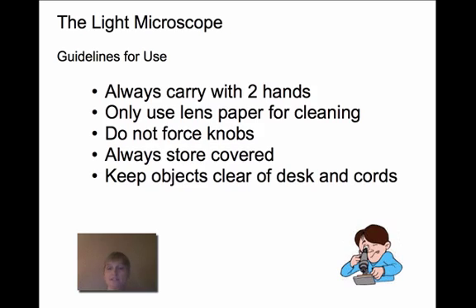All right, so using the light microscope, this is what you're going to be using in class. I want you to always carry it with two hands. Generally, they'll be set up on the lab benches and you won't have to move it, but if yours isn't working and you need to trade it out, you might have to get a different one. So carry it with two hands.